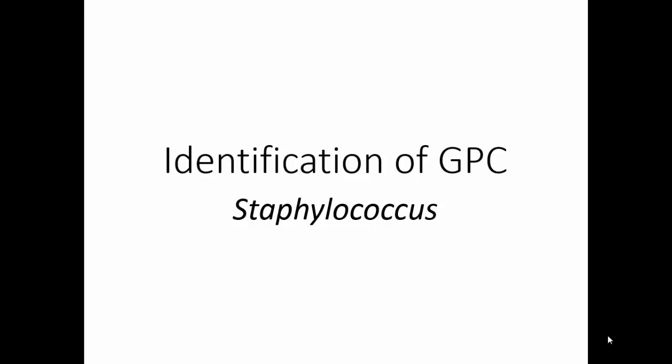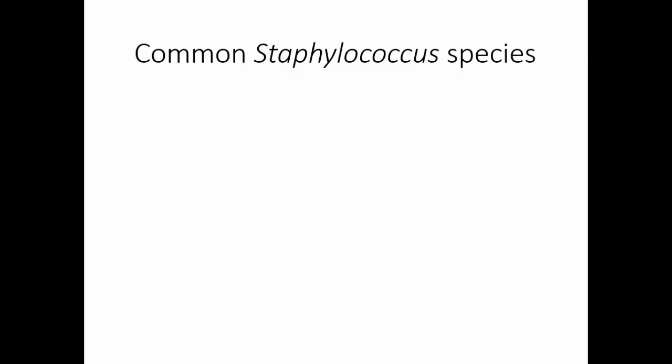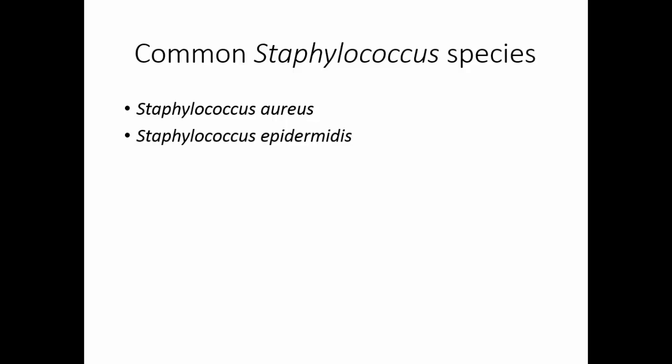Staphylococcus is one of the gram-positive cocci of medical importance. The common Staphylococcus species are Staphylococcus aureus, Staphylococcus epidermidis, and Staphylococcus saprophyticus. Of these three, Staphylococcus aureus is the one that is considered pathogenic.